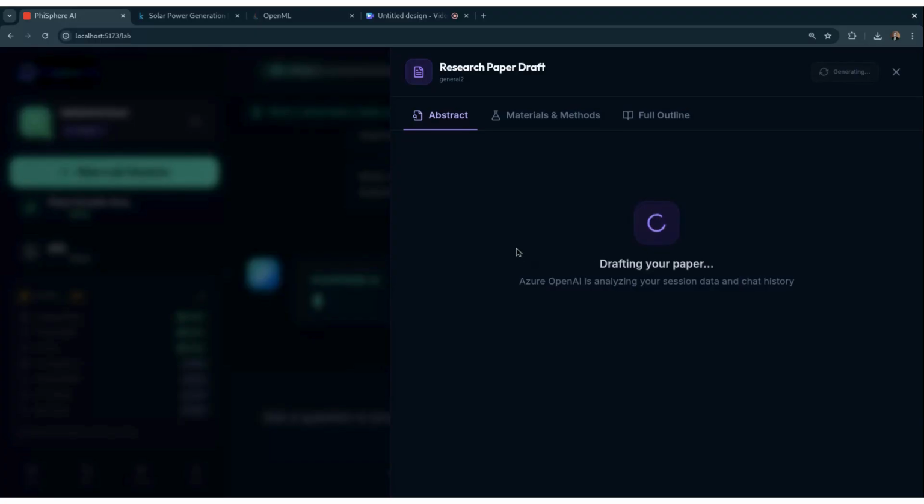After generating the initial insights, the interface allows us to interact more deeply with the experiment. We can explore suggested follow-up questions that help us think like a researcher, not just a data analyst. For example, the system proposes deeper investigations into anomalies, alternative explanations for observed patterns, and even suggests experiments that could falsify certain hypotheses. This encourages critical thinking instead of blindly accepting AI outputs.